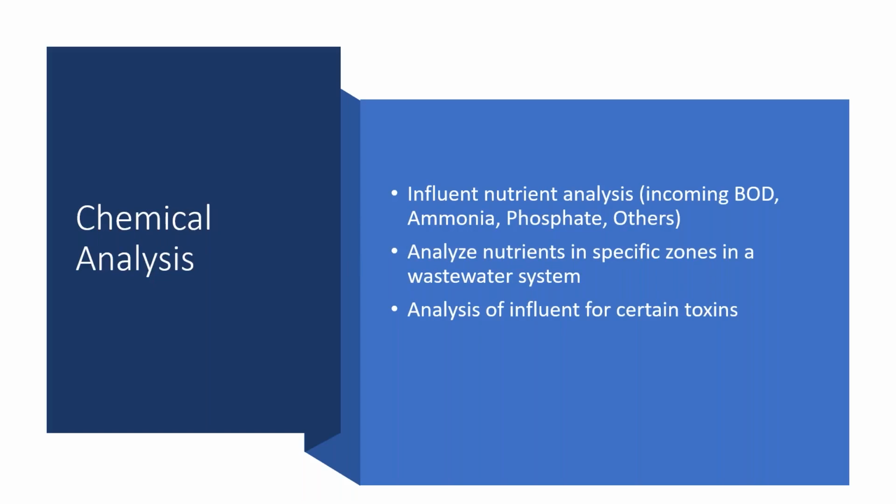The other thing is you can't always tell whether the toxins are active or not active in your plant. For example, if you were to take a sludge sample from your aeration basin and measure quat levels in it, you might notice elevated levels of quat, but a lot of that quat might be stuck to dead and inactive bacteria anyway, so it might not be having any effect on your process at that point in time. So that one's a little more difficult, but it is a possibility in some cases, particularly if you're able to look at a specific time when one customer or client your plant is working with is discharging their waste.